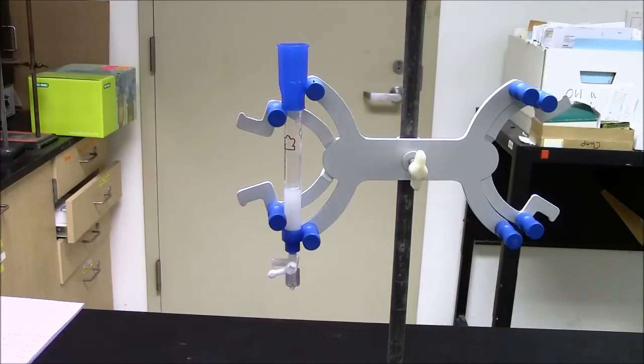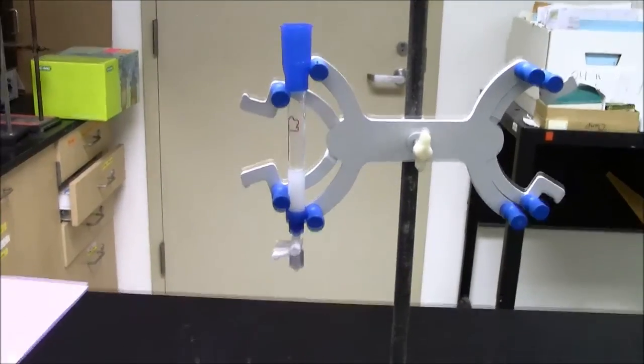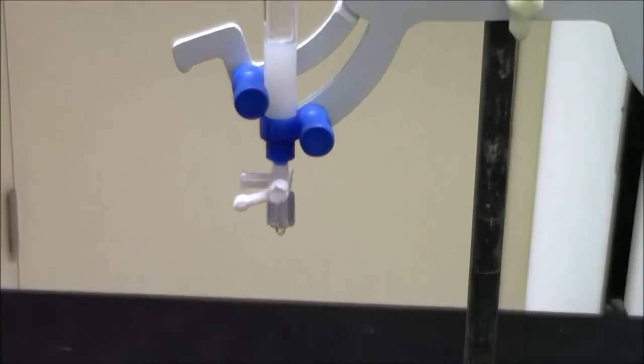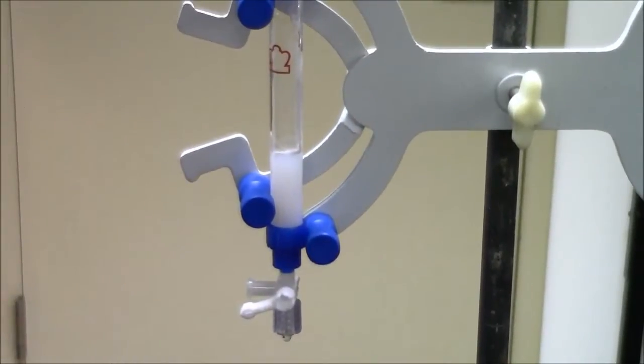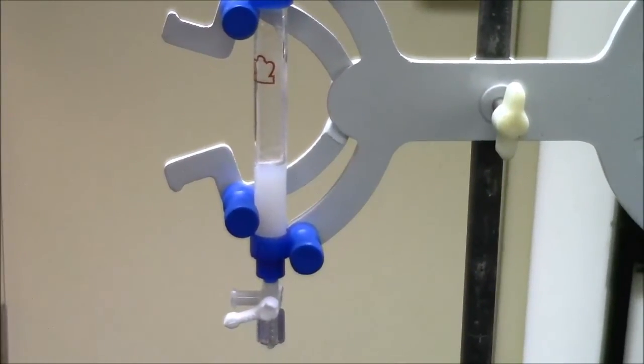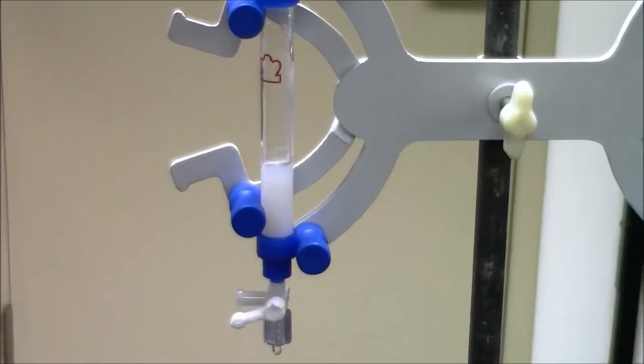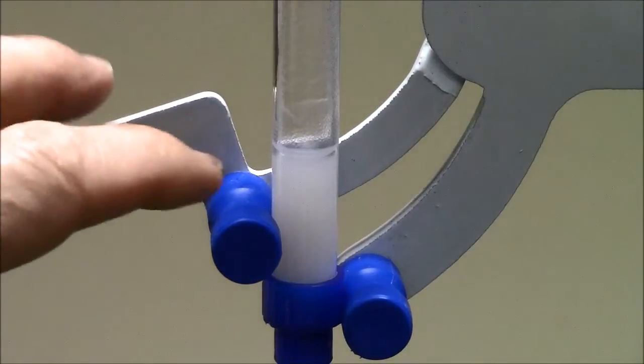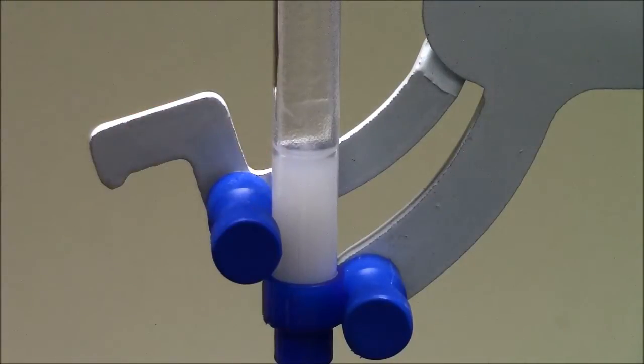So right now, material is dripping out the bottom of the stopcock, which is fine, and the gel will settle into the column. I think I'll actually turn off the stopcock now, and let the gel fully settle before I start draining it anymore.